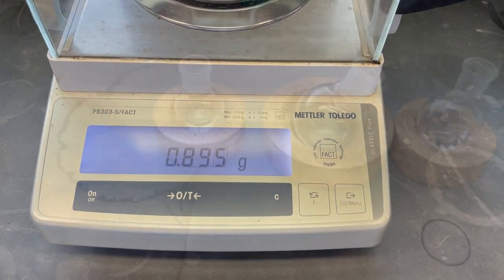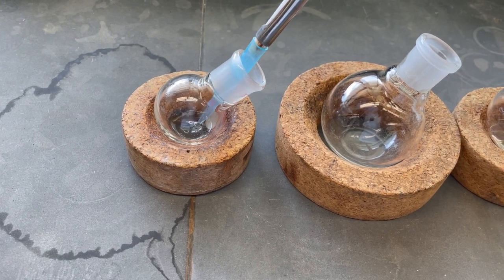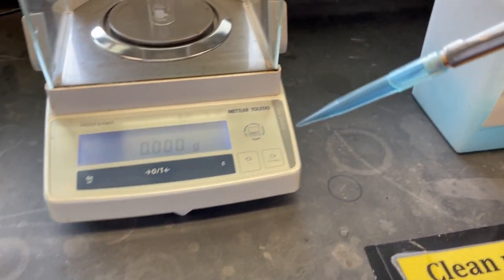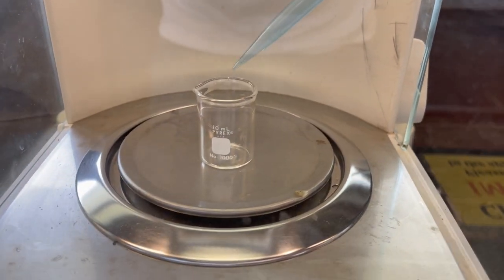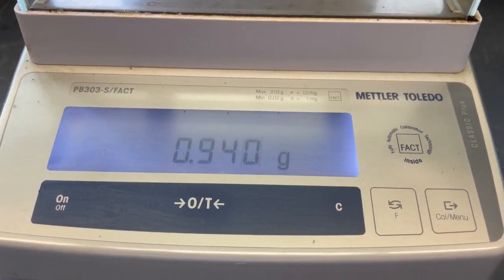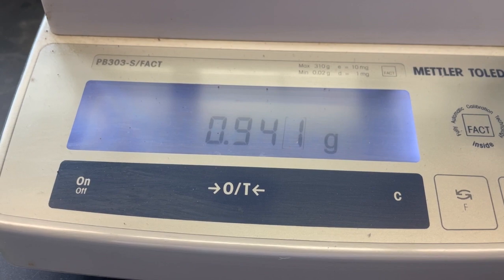Let's take another sample of it. All right, so let's take another sample. Here we go, make sure none drips. Transfer this to our beaker, and see what we see. Oh yeah, ain't that a good one? We'll do another one just to average that out.